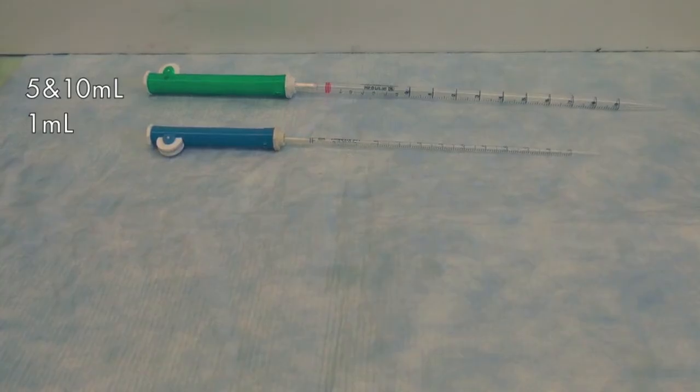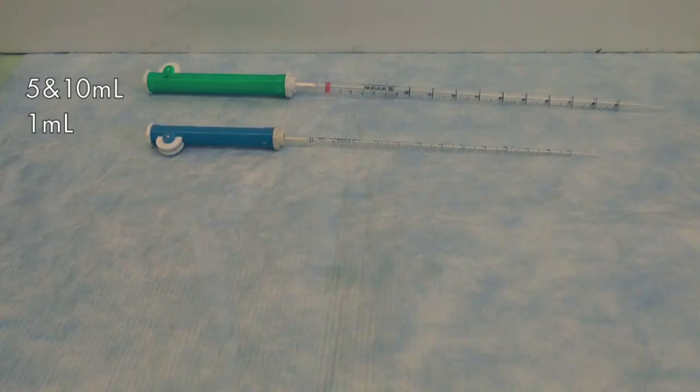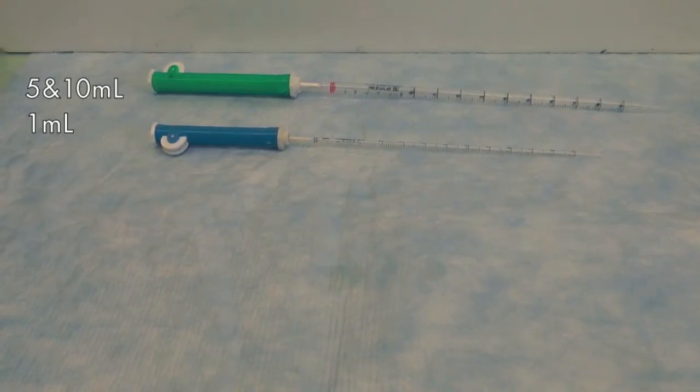Pipette pump is one common tool used to operate a pipette. Pipettes in different sizes are coupled with different pipette pumps. The green pipette pump is used for 5 and 10 milliliter pipettes, while the blue pipette pump is for 1 milliliter pipettes.